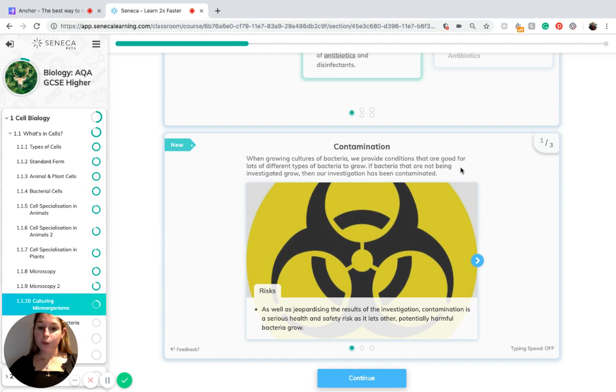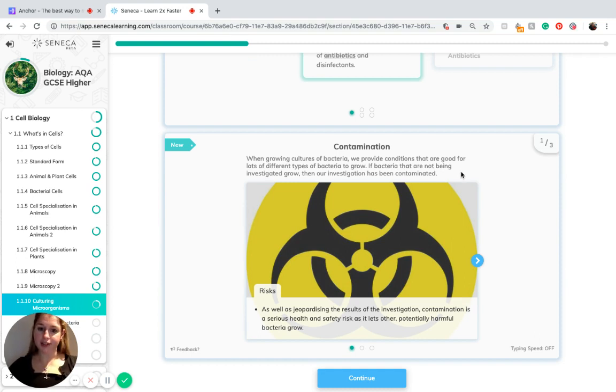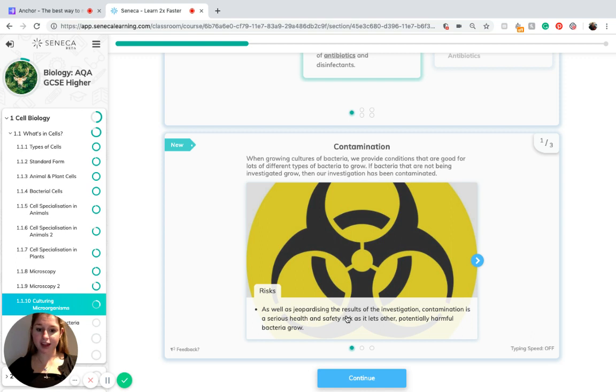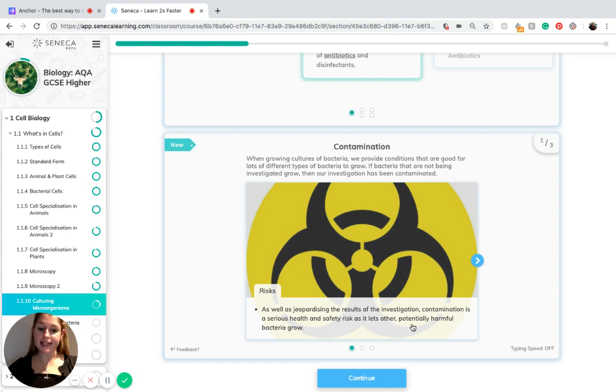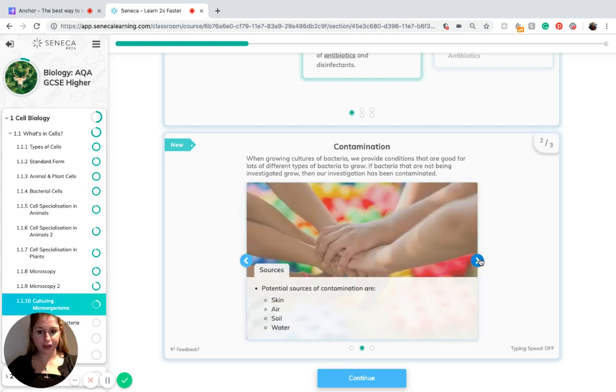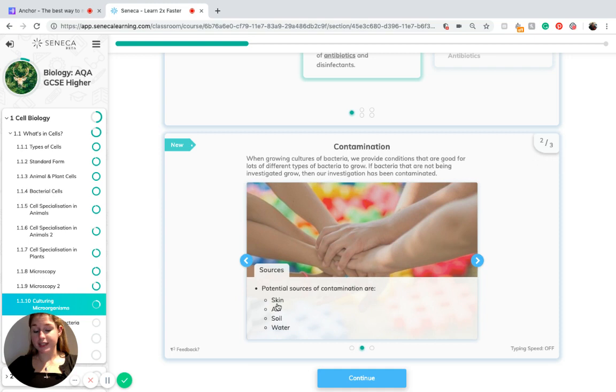When growing cultures of bacteria, we provide conditions that are good for lots of different types of bacteria to grow. If bacteria that are not being investigated grow, then our investigation has been contaminated. The risks of contamination? As well as jeopardizing the results of the investigation, contamination is a serious health and safety risk as it lets other potentially harmful bacteria grow. For example, they may cause a disease. The potential sources of contamination may be from your skin, the air, soil or water.